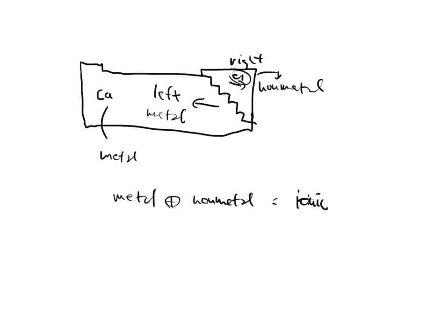Well, this is what is classified as ionic as far as structure goes. If you have all nonmetals, then this is going to be classified as a covalent structure. And that covalent structure is also a very good sign that this thing is a total organic carbon source.